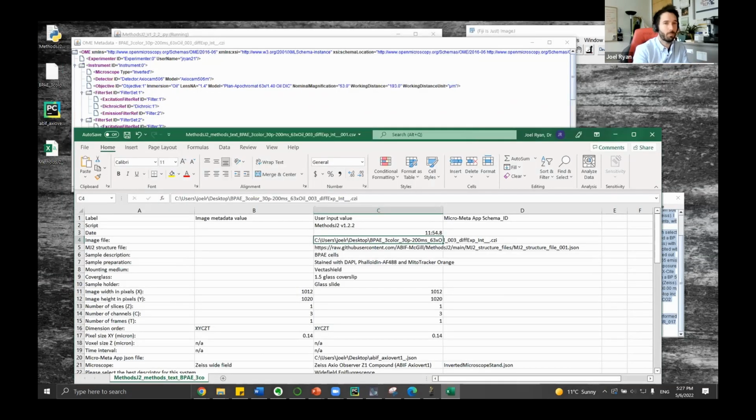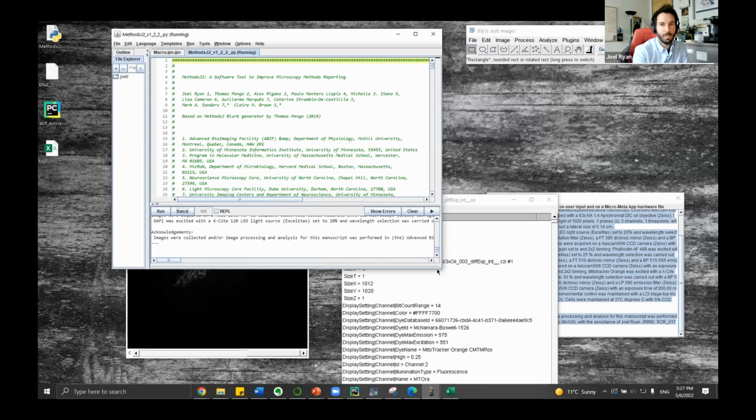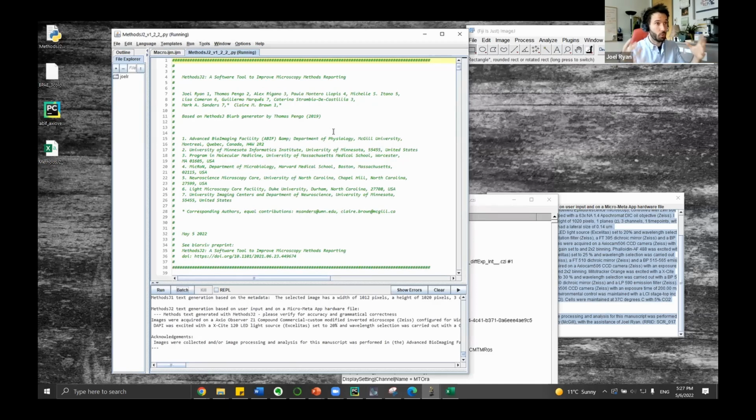Perhaps one last thing to point out, if I have just another moment or two, is that it runs essentially on this script. This script is very much actuating, doing things like creating those dialog boxes and whatnot. But a lot of the information that's used to generate the dialog boxes is in yet another JSON file, which is online.